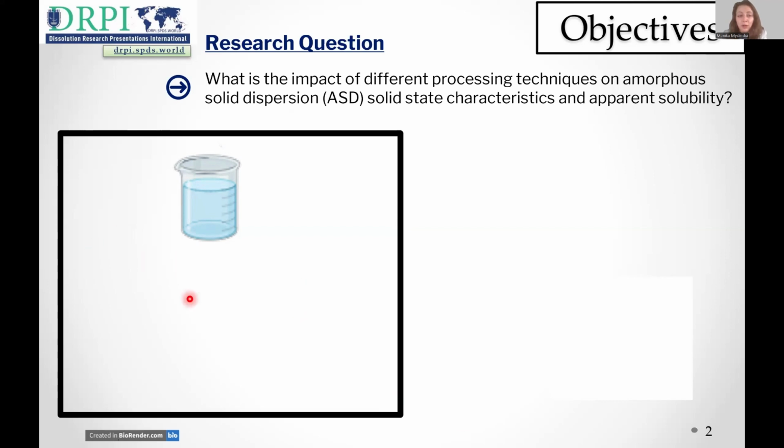Spray drying technique, which is already a well-established method in the pharmaceutical industry, involves atomization of a liquid feed into fine droplets, followed by a rapid evaporation process of solvents and formation of dry particles. However, some of the drawbacks of this technique are associated with highly expensive equipment, possible poor downstream properties of powders, and the requirement for the compounds to be soluble in volatile solvents and to not be heat sensitive.